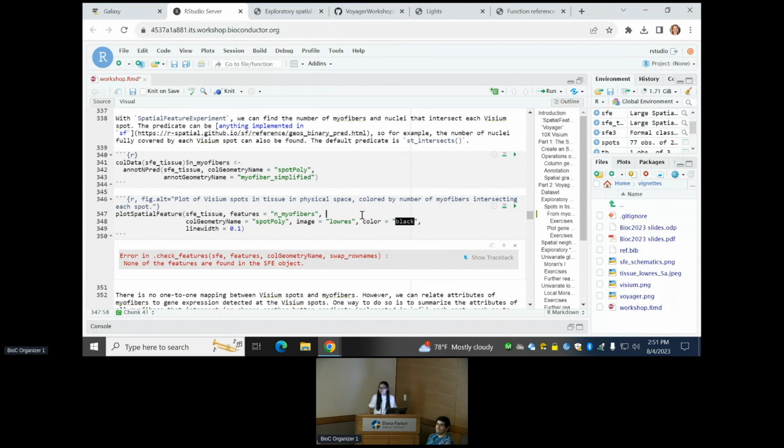Is there an interactive tool that the annotation was done on? Yeah, in Fiji or ImageJ, I used a plugin called LabKit. Actually, in Voyager itself, I don't really have the background, and I really stink at Shiny, so as a result I don't have an interactive tool inside Voyager. Maybe yet. I think there is one in Bioconductor, like iSEE, things like that.